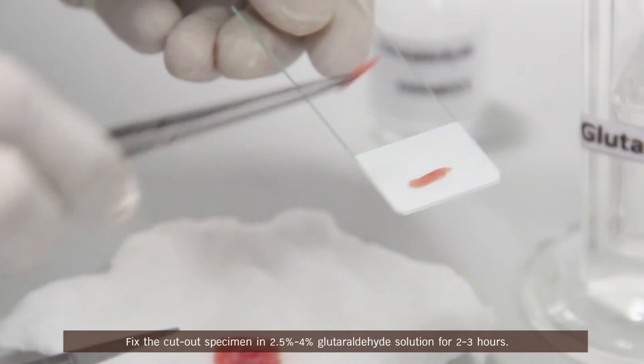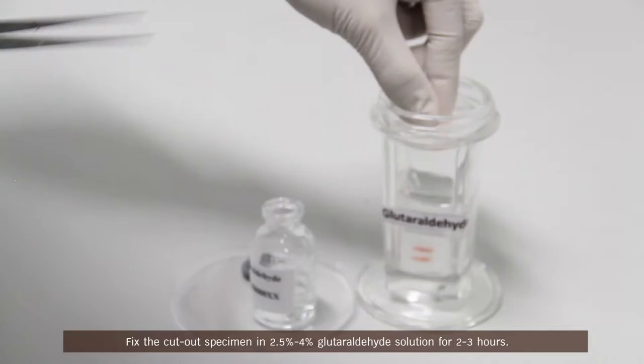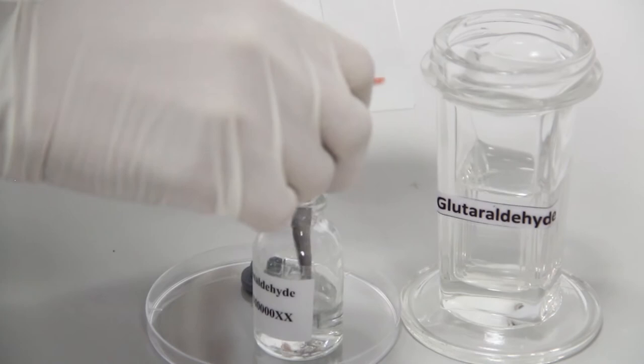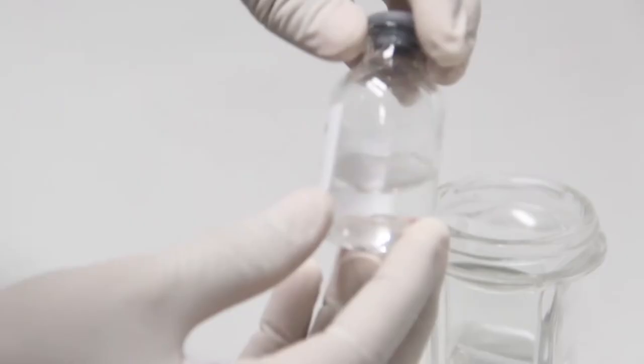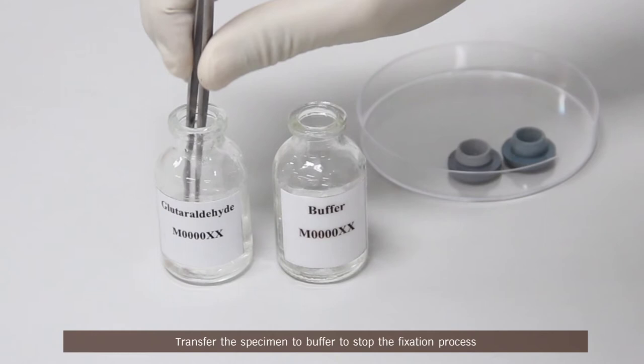Fix the cut-out specimen in 2.5-4% glutaraldehyde solution for 2-3 hours. Transfer the specimen to buffer to stop the fixation process before sending to the electron microscopy laboratory at room temperature.